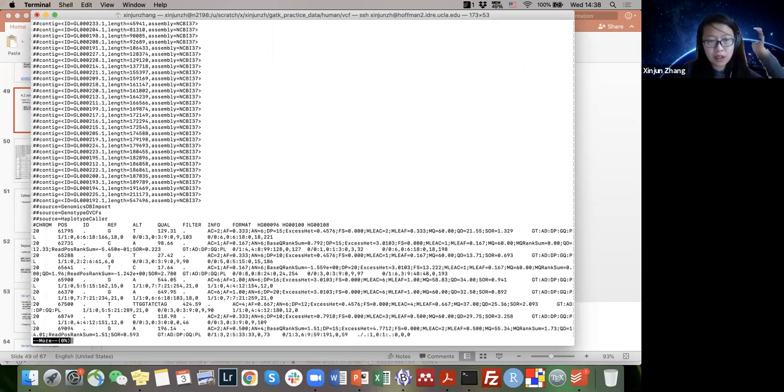This is the start of our raw VCF output. We have our header. We see the first 9 columns and we have 3 individuals. This file only contains the variants, instead of the GVCF that contains both variants and non-variants.